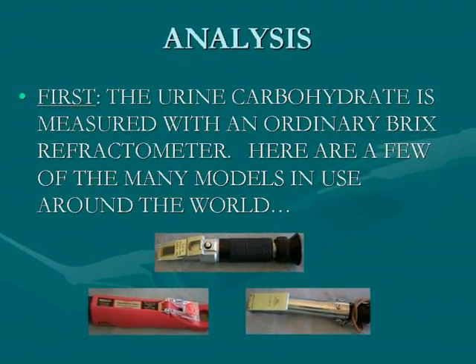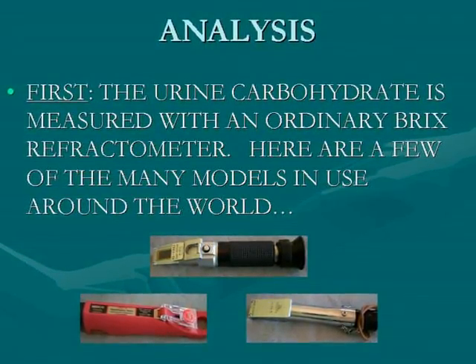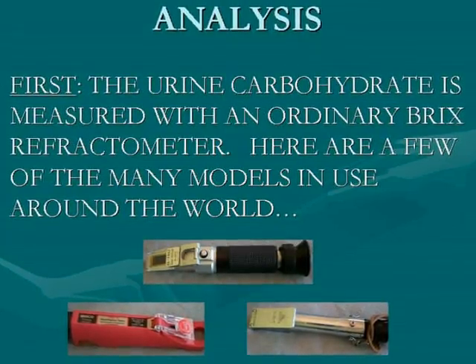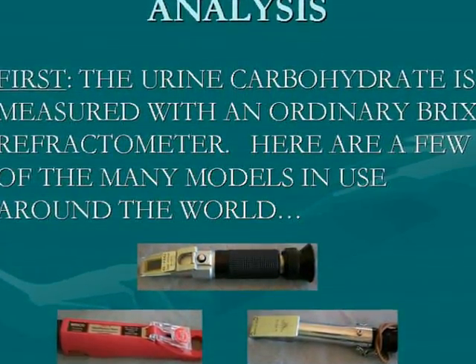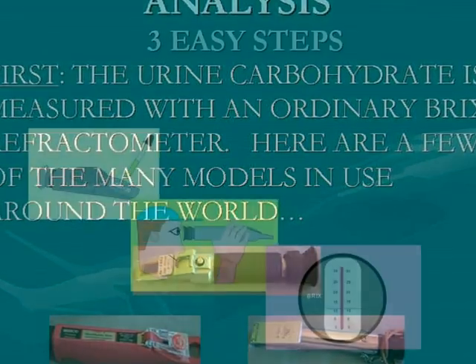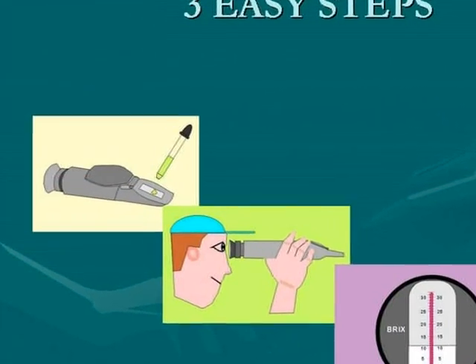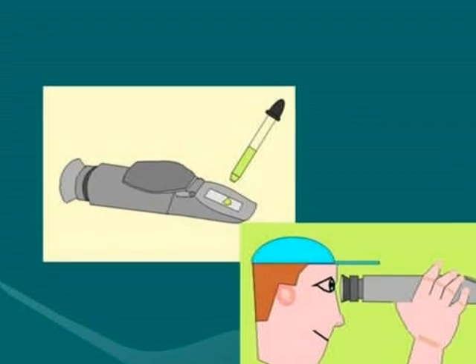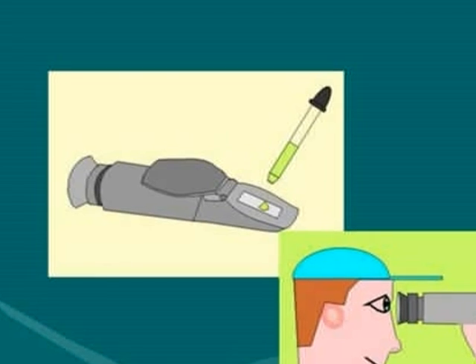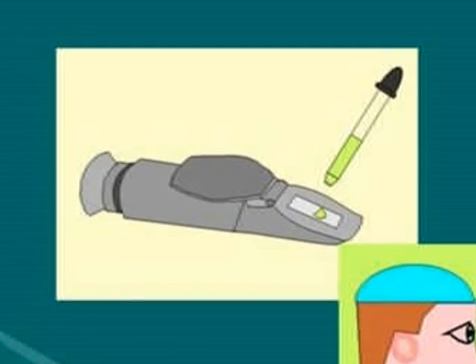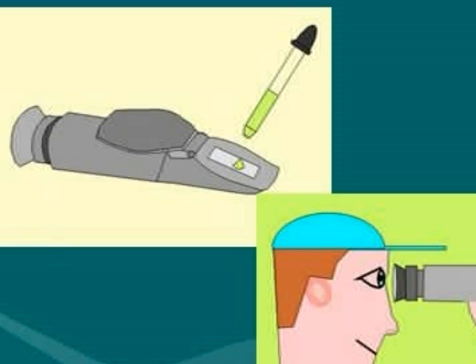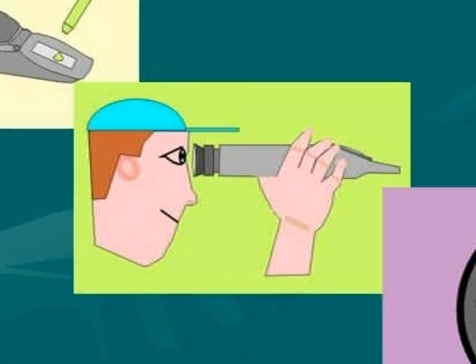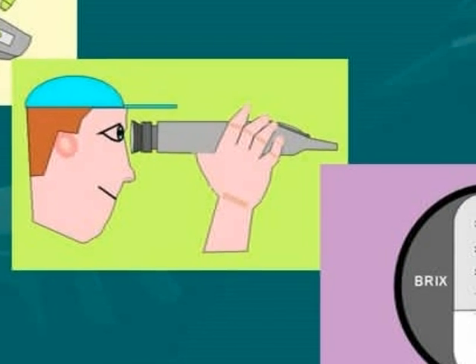The first part of the test or analysis is to measure the BRICS of the urine. Here are a few refractometers. Which kind you use doesn't matter as long as it's a good, high quality one. Urine BRICS testing is about as easy as anything could be. You're merely going to lay your sample or drop on your prism, flip it down, then look through the view eyepiece, and finally record what you see.